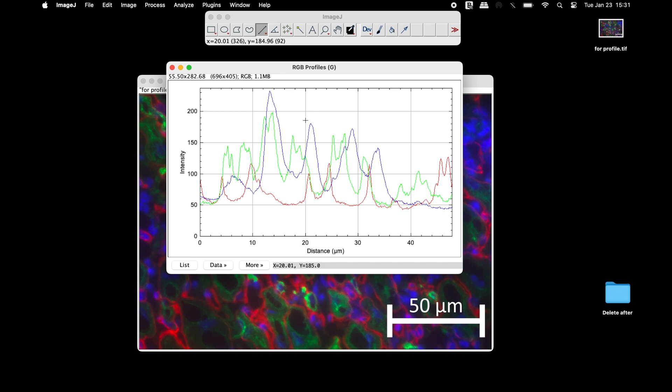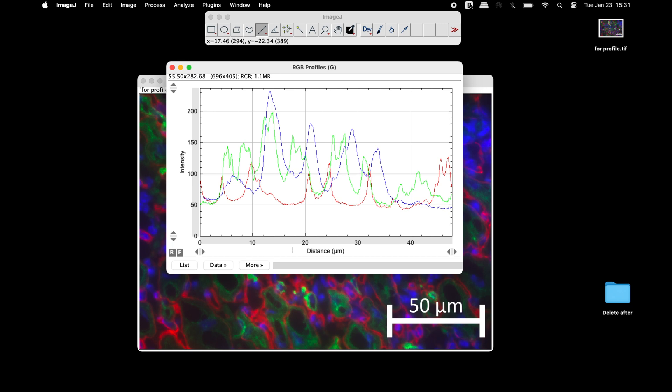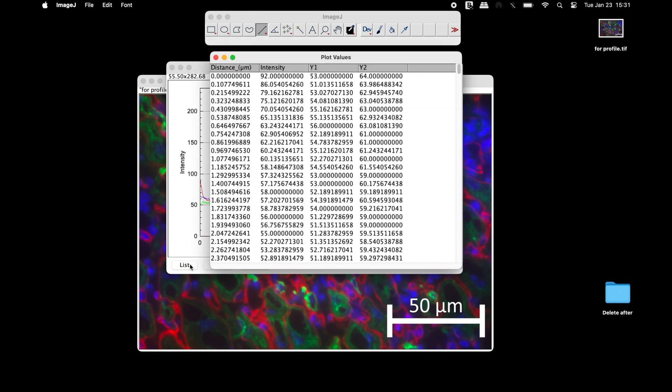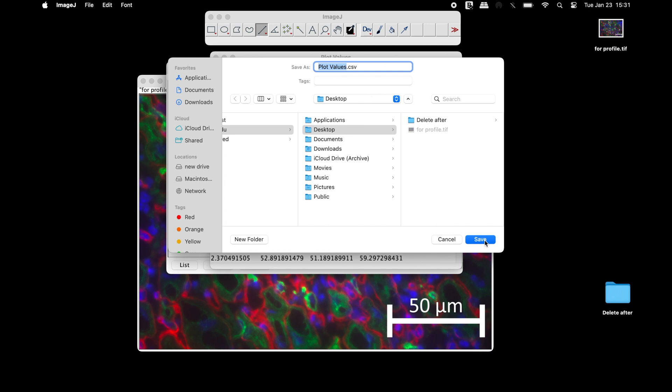The output is the profile plot of the green, red and blue intensities along the Y axis, and distances in micrometers on the X axis. Click on List to find the data for the intensities and the distances. This list can be easily saved in a .csv format.